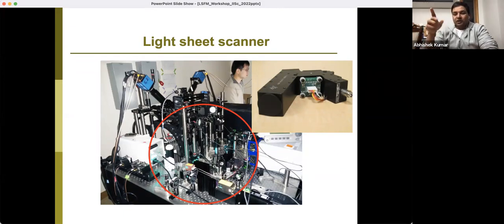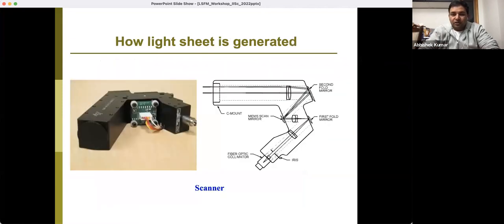It lets you scan in the y direction to create a virtual illumination, and the other axis you can use to move your beam in the third dimension, Z. So basically this allowed us to make a compact laser scanner or illuminator for doing this sheet-like illumination.